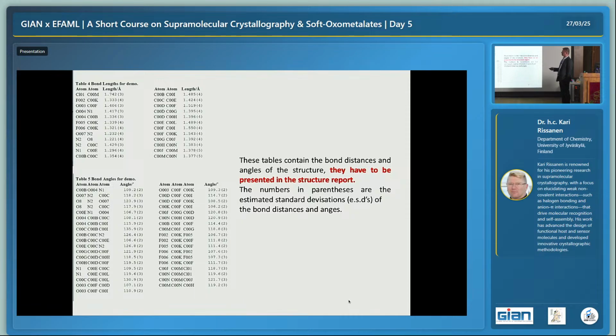And it's a historical reason. So the 3 sigma would be better nowadays, because it's more accurate. Of course, it's easy to calculate. But that's the idea. And here you can see the fluorine-carbon distance is about 1.35 roughly.